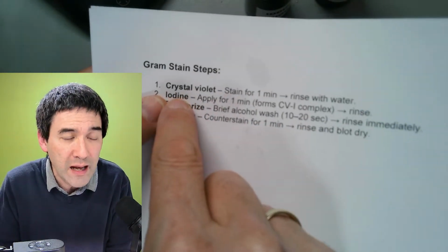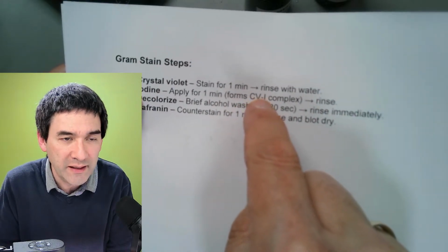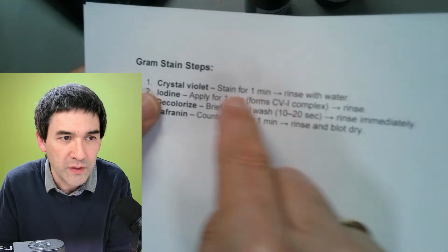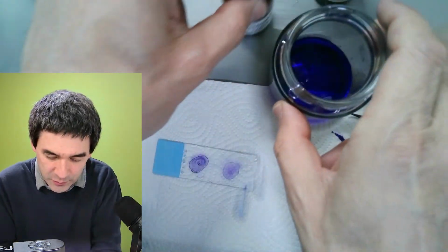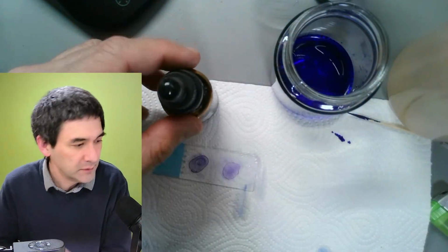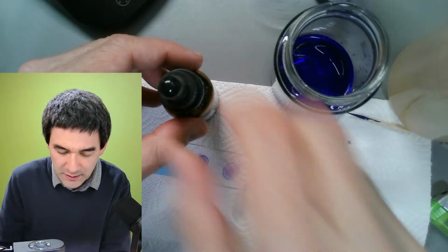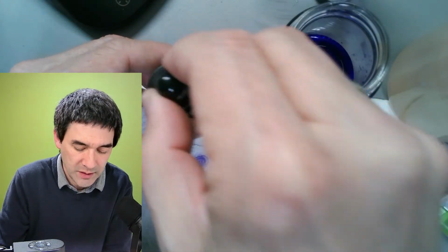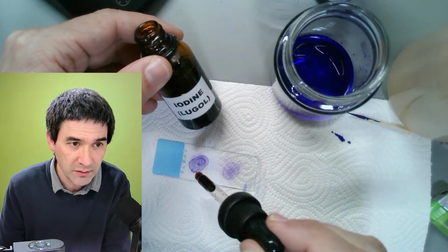Now I have to add iodine. Apply for 1 minute. It forms a crystal violet iodine complex, and then I have to rinse it. So I have to now add some iodine to it. So where's the iodine? Over here. Same story. I'm going to use again a fresh toothpick in this case. So you want to be careful with the iodine as well. It's also a very strong one. Yeah. So here it's iodine.